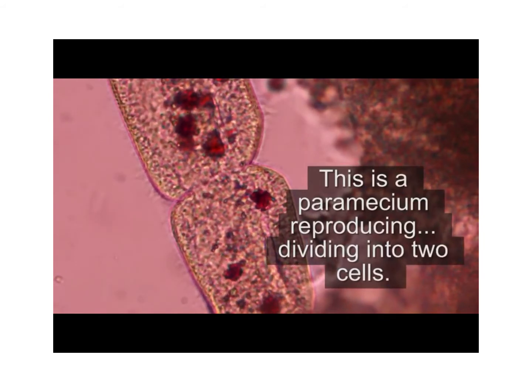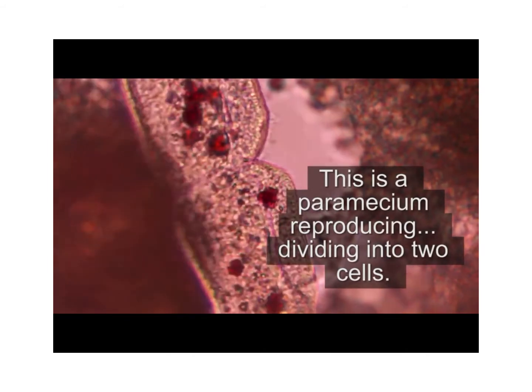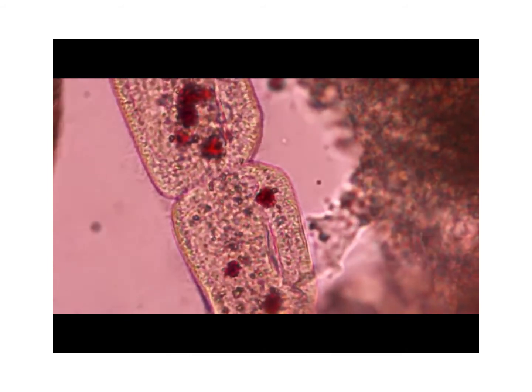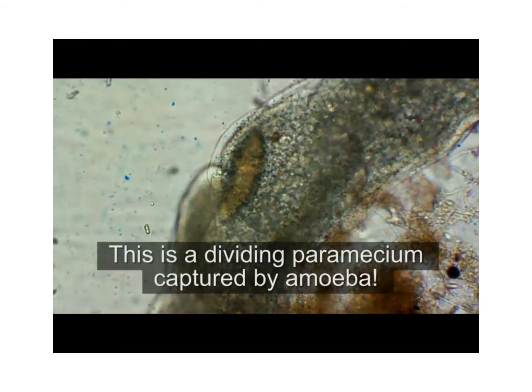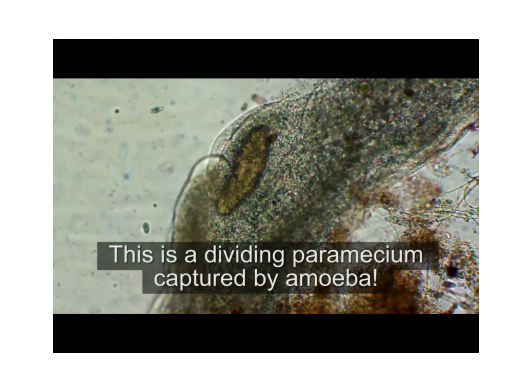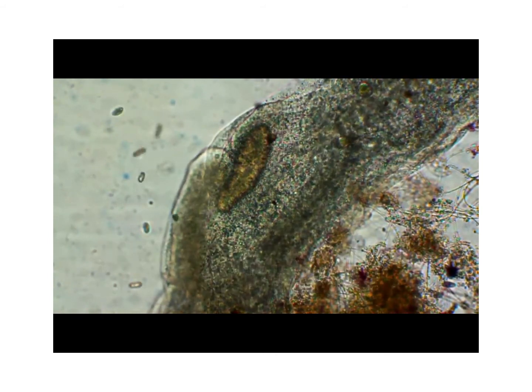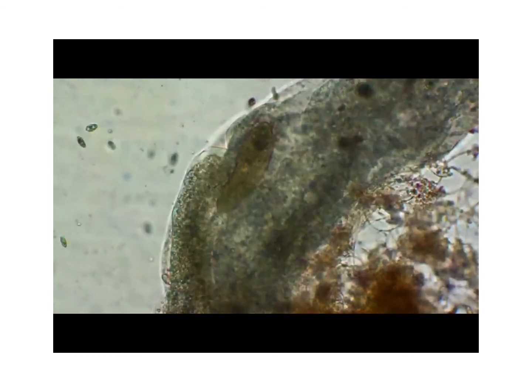This is Paramecium reproducing, dividing into two cells. You can see that there. Things are being split. We call that asexual reproduction. It's dividing Paramecium that's been captured by an amoeba. So yes, living things live and then they die, sometimes by being eaten.